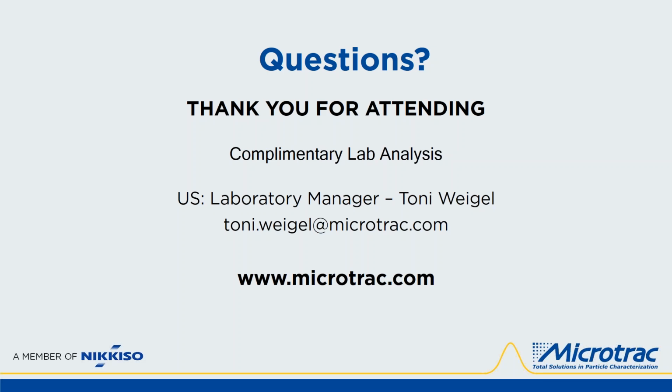Can we get into the details of how to do the calibration for that? The unit is factory calibrated. Okay.